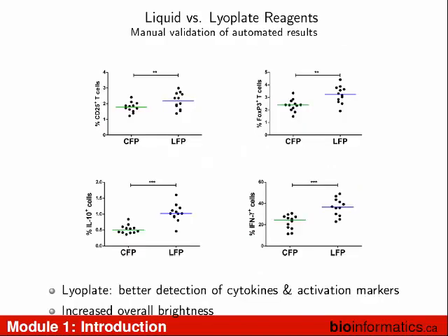And then you go back again and manually analyze it by hand. And actually, in the lyoplates, the brightness is increased. So it's actually a better reagent, better than liquid. I don't really care. All I care about is that the tool worked and found something that the biologists were able to validate.